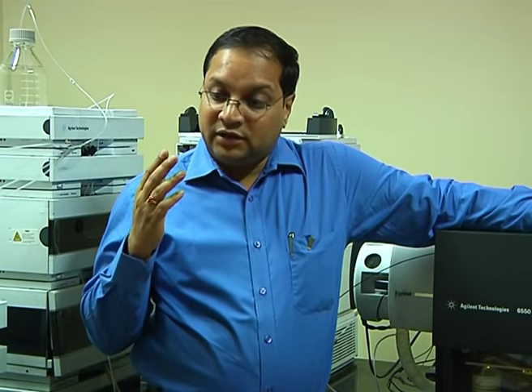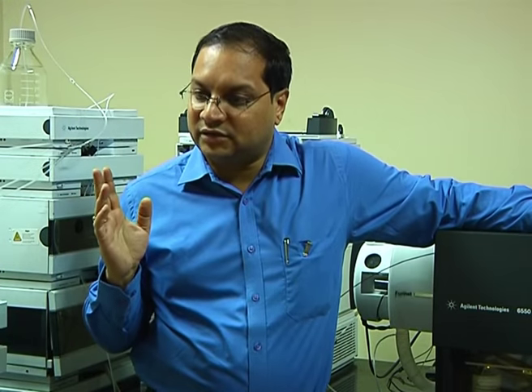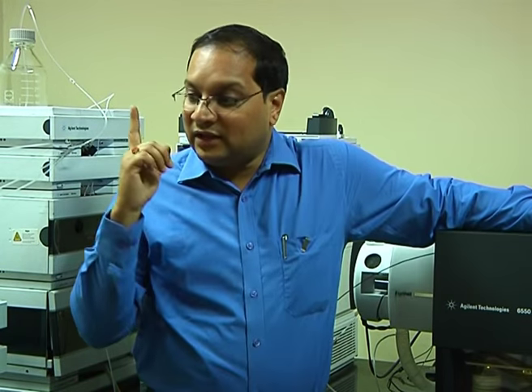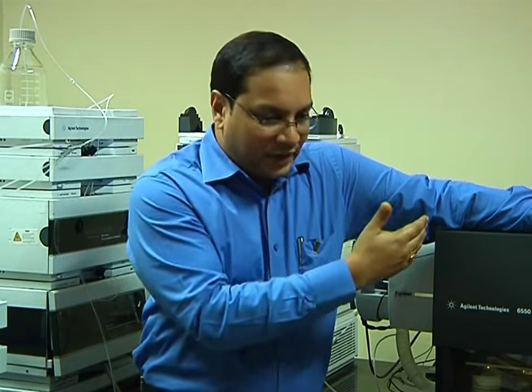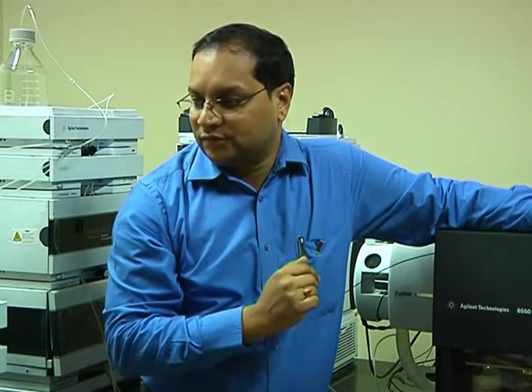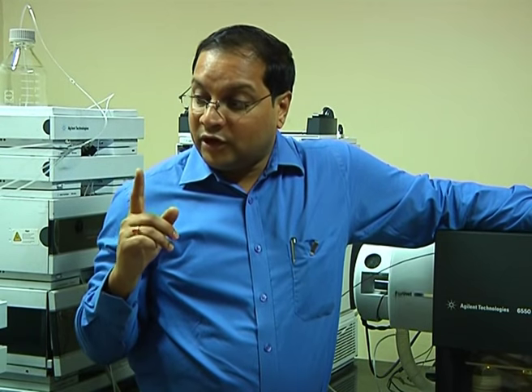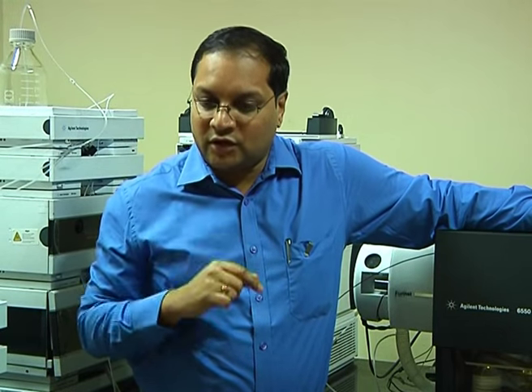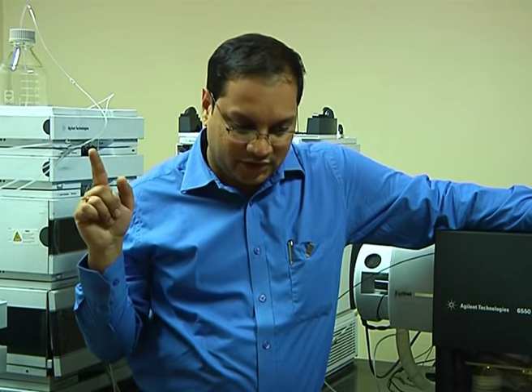The third one is data directed or targeted MS, which is possible because we have quadrupole time of flight. When I say targeted, you have to define what masses you want to select, and it will trigger MS/MS and give it to you. What it means is that a quadrupole time of flight device can also be used for quantification.